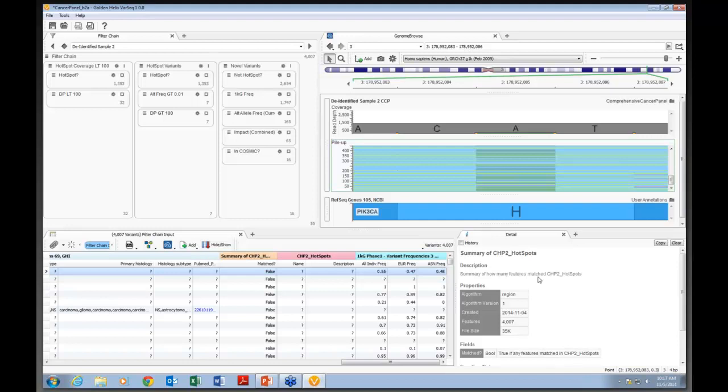And what you'll find with VarSeq is that if you have any custom annotation sources that you want to use as part of your analysis, it's very easy to integrate them. And as long as they're in either a standard text file, tab or comma delimited flat text file, or perhaps in a VCF file or a bed file, or any of a number of other common formats from bioinformatics, we can bring them in and work with them here.